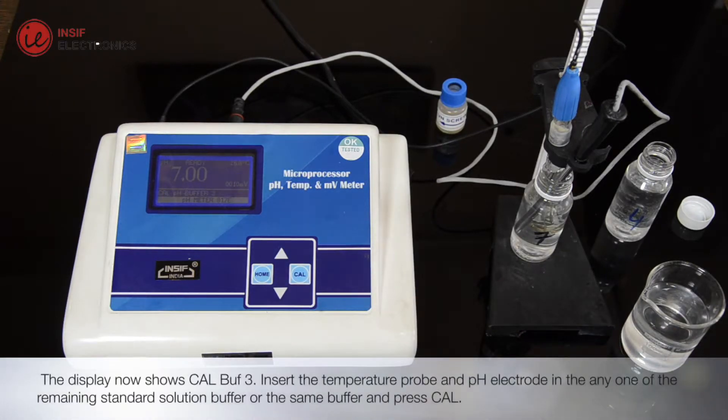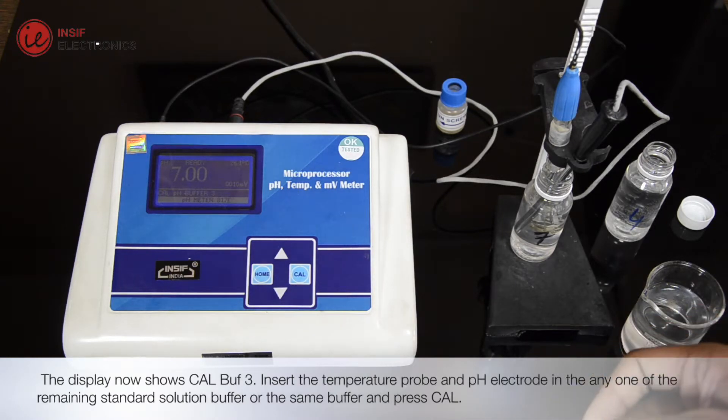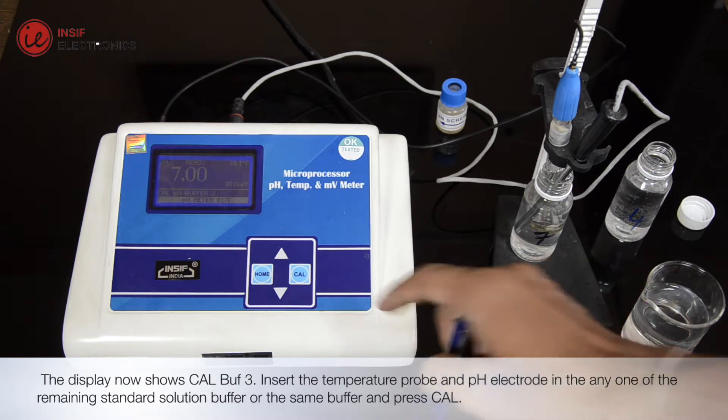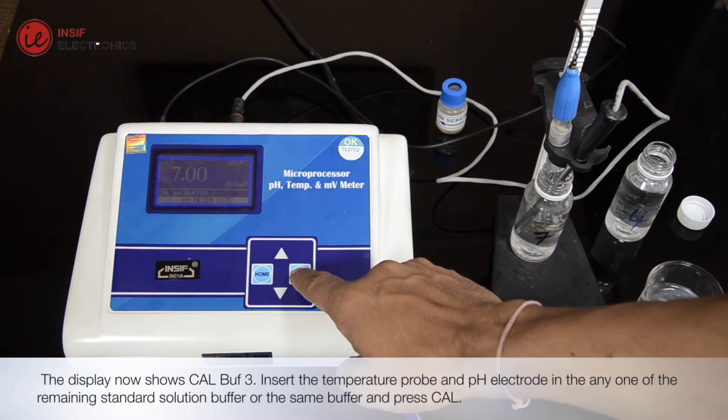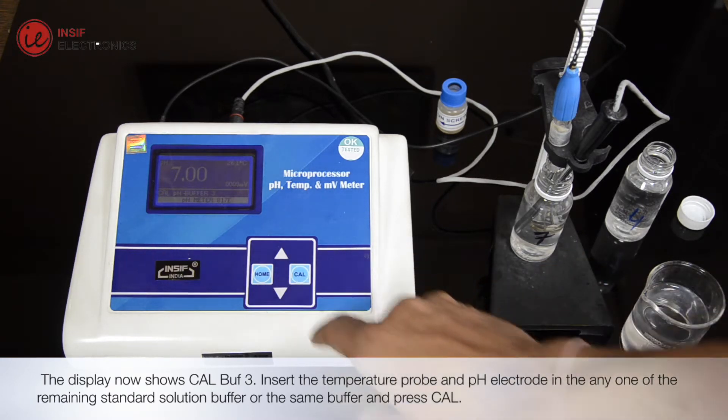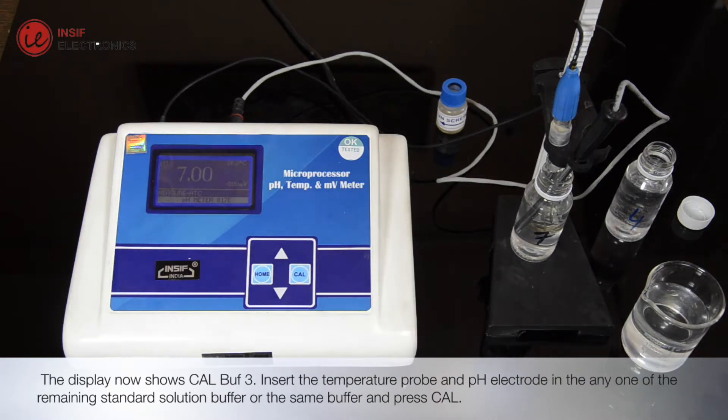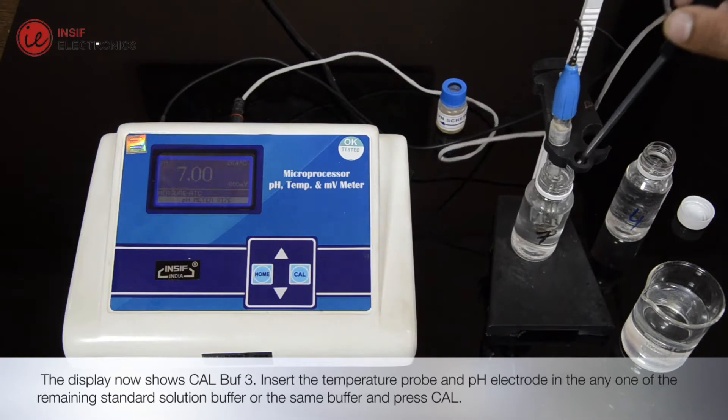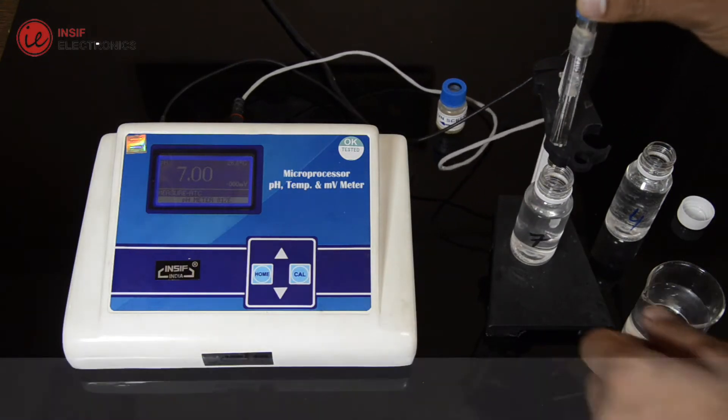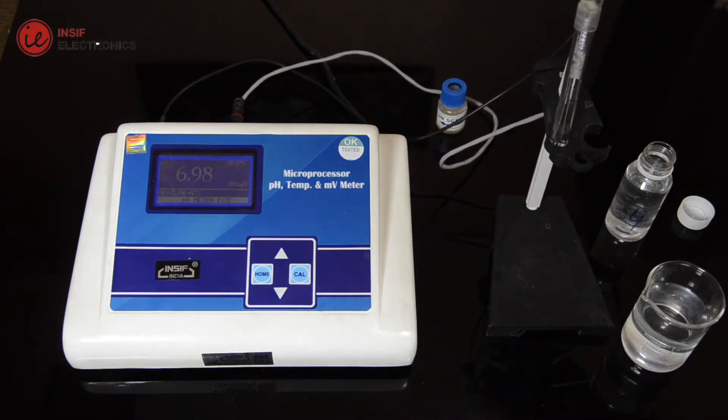The display now shows CalBuff3. Insert the temperature probe and pH electrode in the NE1 of the remaining standard solution buffer, or the same buffer, and press Cal. The backlight blinks, and instrument returns to measurement mode. The calibration procedure is complete now, and the instrument is ready for measurement.